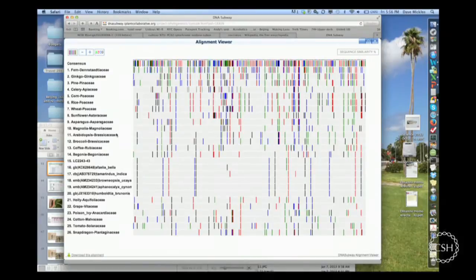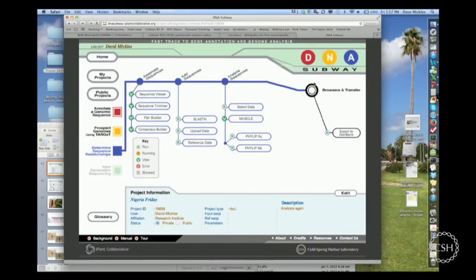Now we have pretty pure barcodes here. Again, here's how our group is shaking out. Here's the polymorphism difference between my sample and the GenBank record. Let's build a tree. Now, I'm not an expert at trees, so if you ask me a lot of questions about it, I'm sure to give you the wrong answer.